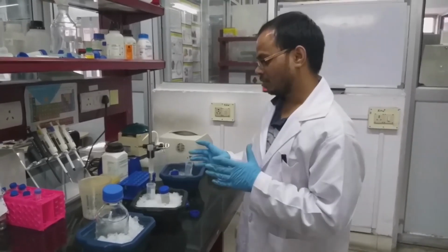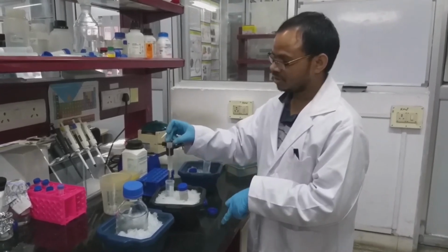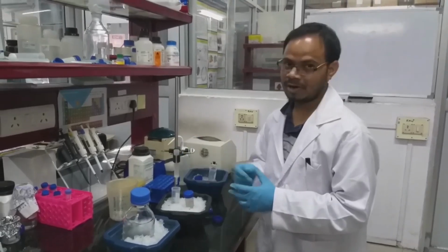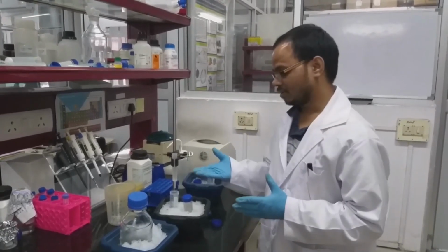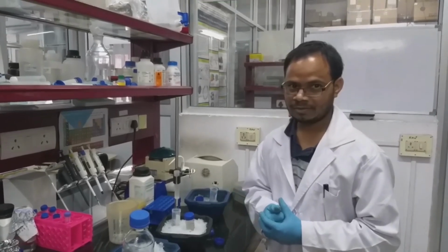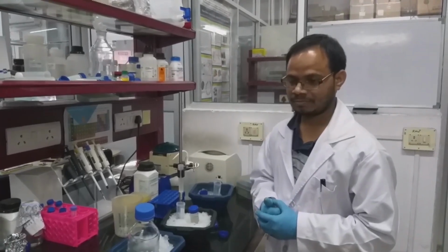Before doing this, we have to observe the beads. We should not directly load onto the beads. You just have to pour through the corner, through the wall of the column. Otherwise, it may disturb the beads, so the protein may also degrade. So we have to keep this in mind while doing this washing.